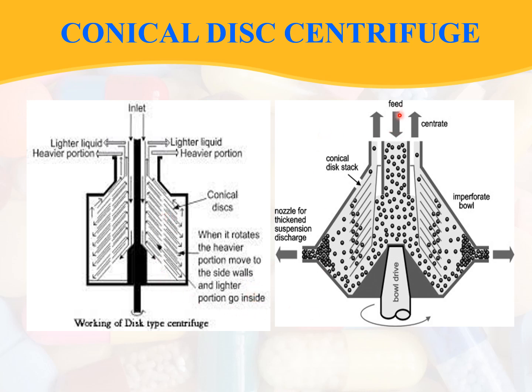Here you can see this is the feed inlet. These are the conical disc stack. Nozzle for thickened suspension discharge. Imperforated bowl. And this is the motor bowl drive.